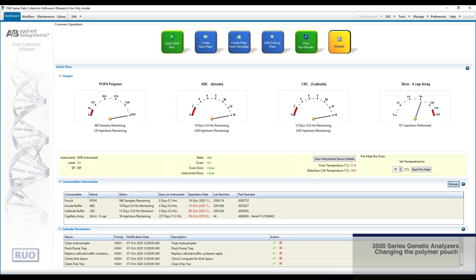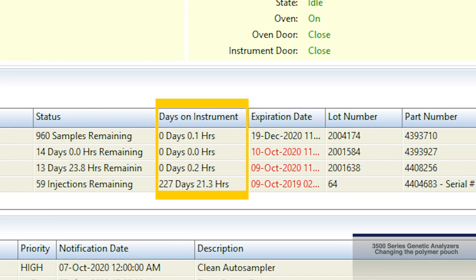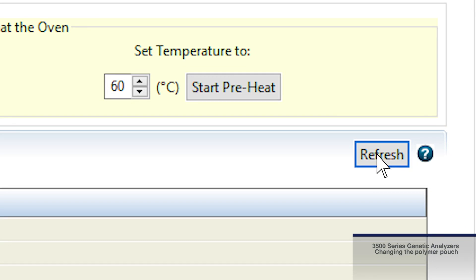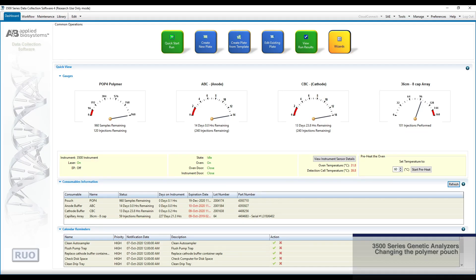This information includes lot number, days on instrument, and expiration date. If the software has not updated, simply hit the refresh button and the data collection software will read the information from the newly installed consumable's RFID tag.